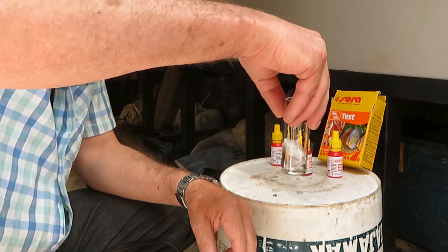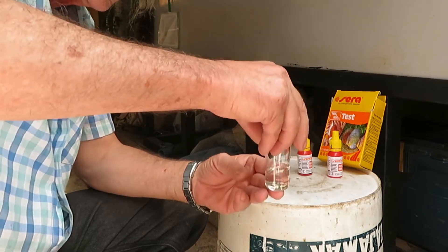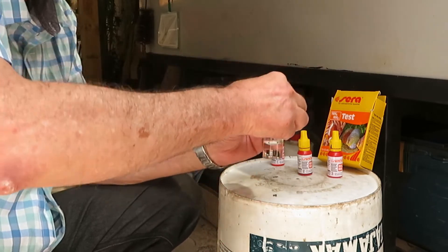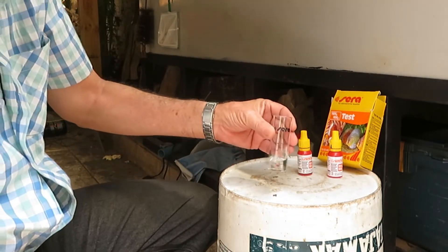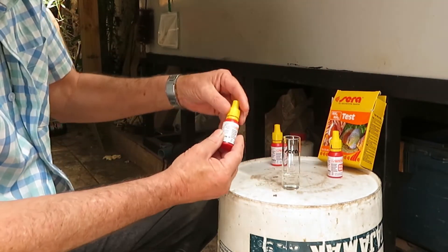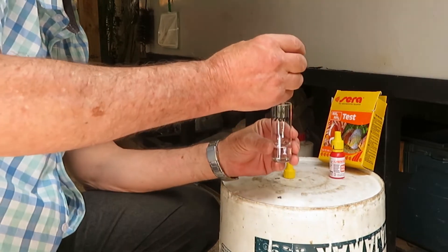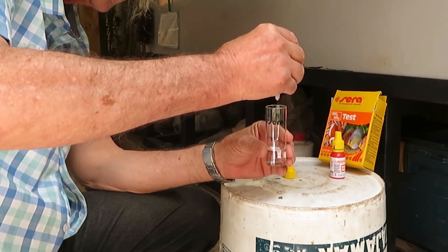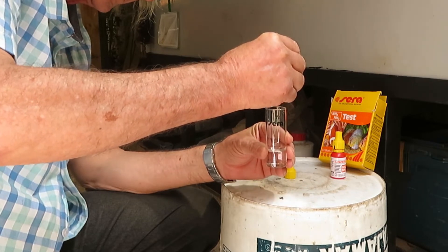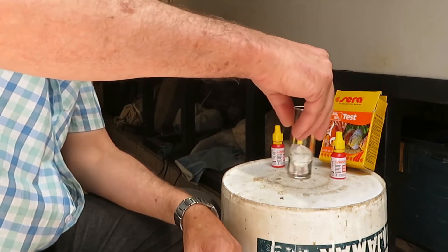Once the first reagent is well mixed, we move to bottle 2. We remove the cap and add 6 drops of solution 2 into the flask. We put the cap back on and shake carefully again.